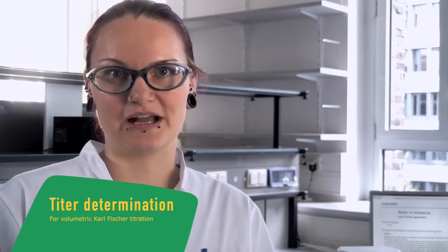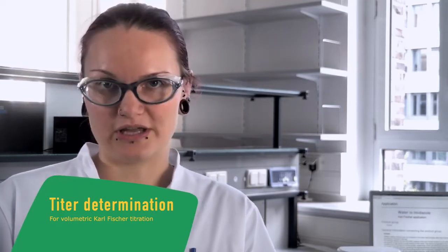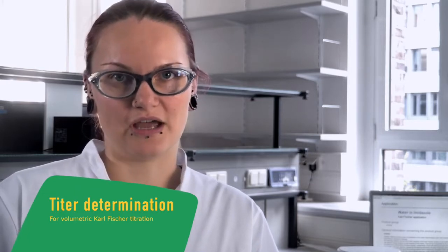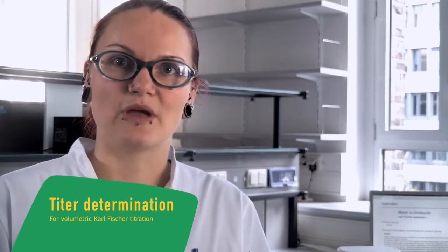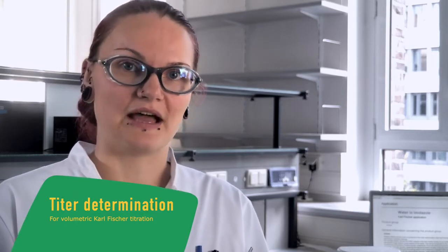Today I'm going to show you the Titer determination of the volumetric Karl Fischer titration. This is important because the concentration of our reagents may change over time, and to receive right results we have to determine the Titer. I'm going to show you how to do it in a few steps afterwards.